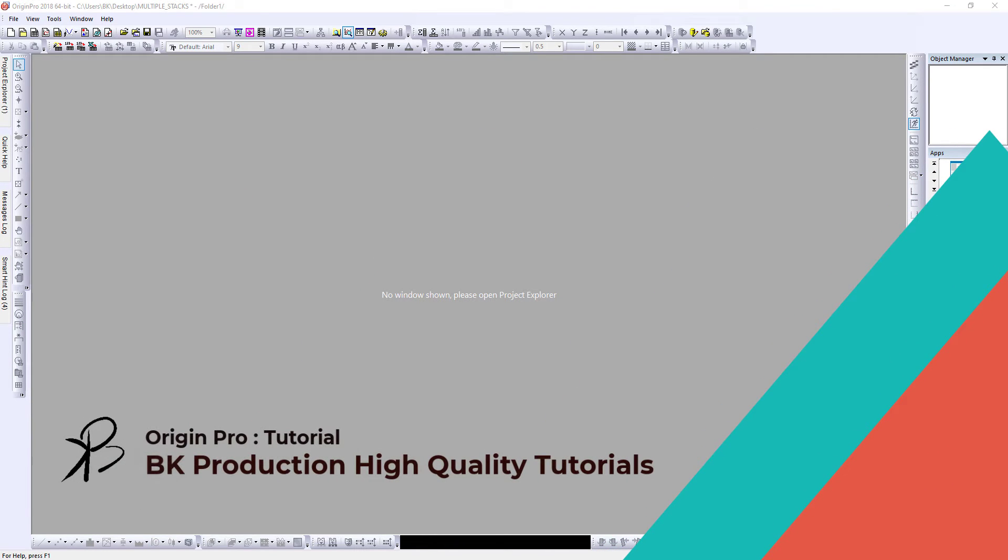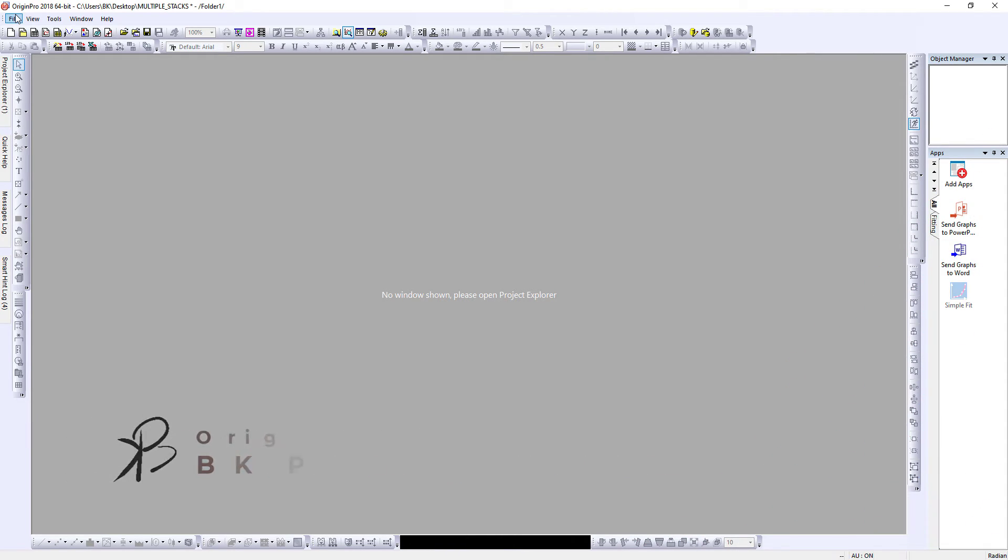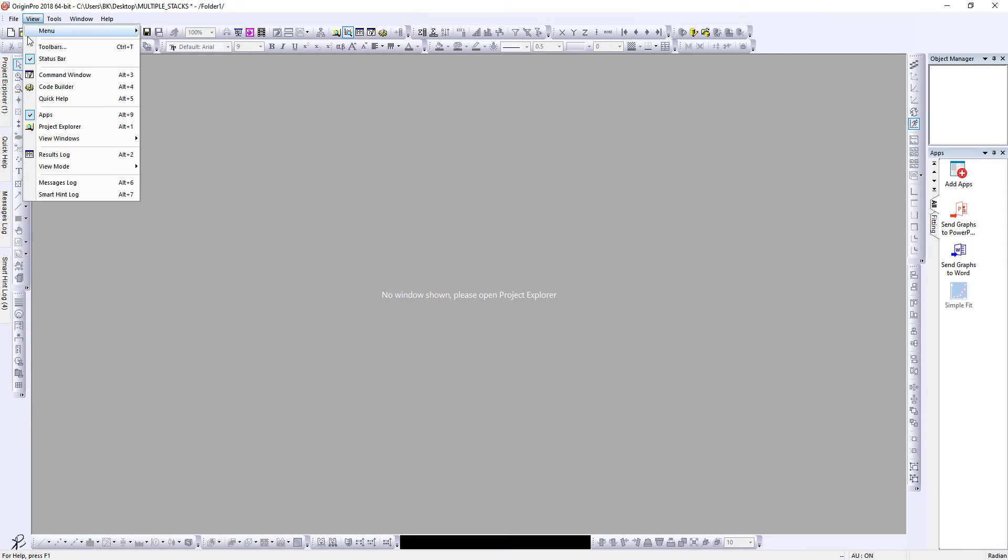Hello and welcome back. In this lecture we will learn how to plot stacks in Origin. Let's say you have three sets of X-Y data and you want to plot it on a single graph, maybe in a single plot or as a stack, as a vertical or horizontal stack. How to do that?